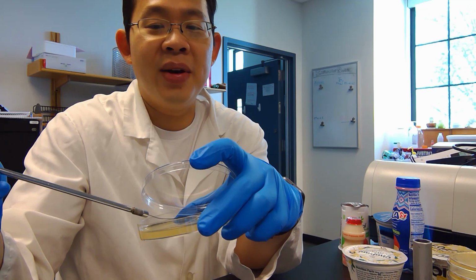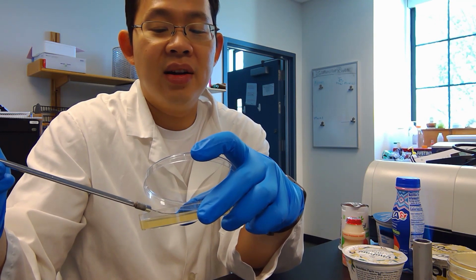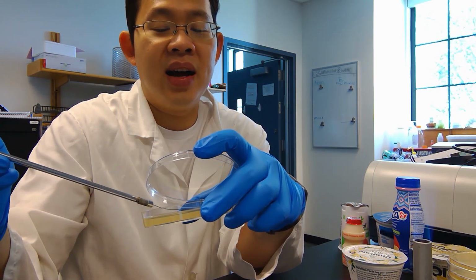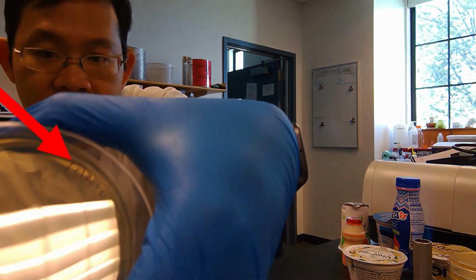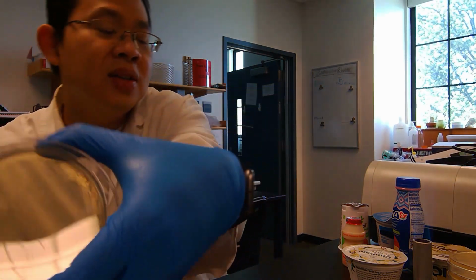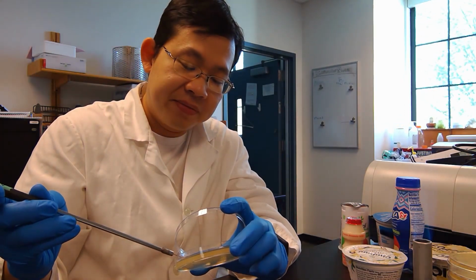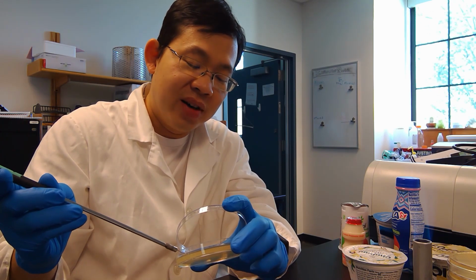Just put it over there, and at first you will see a mark, because when your loop is hot, it will melt the agar underneath and leave a mark, something like that. I don't know if you can see that. Yeah. Then you do it multiple times until you don't see any more marks.